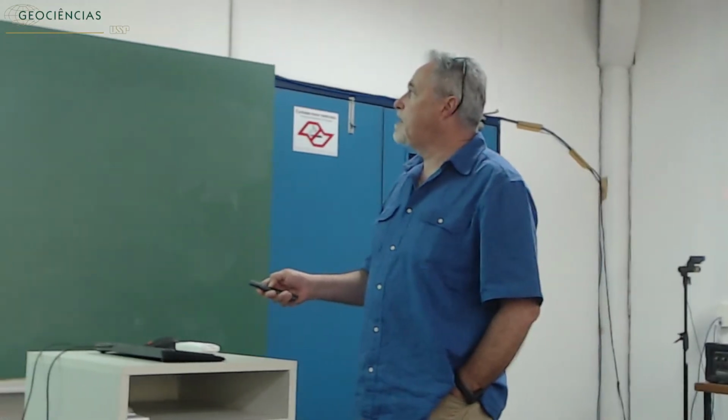So, for example, that's the average size of the M1 octahedron, the average M-O distance of the M2 octahedron. The solid symbols are the powder data, the empty symbols are single crystal data from the literature, so they compare nicely well.